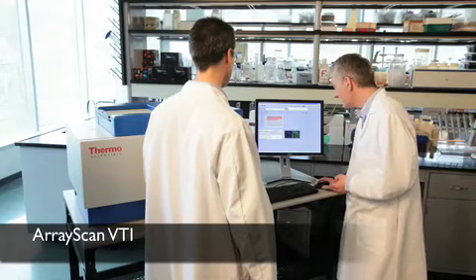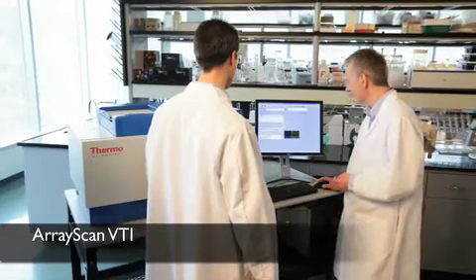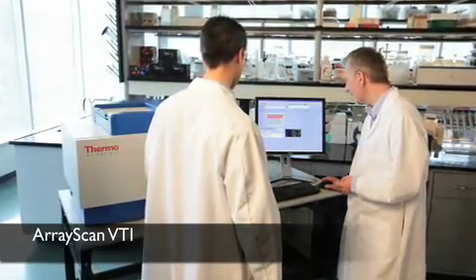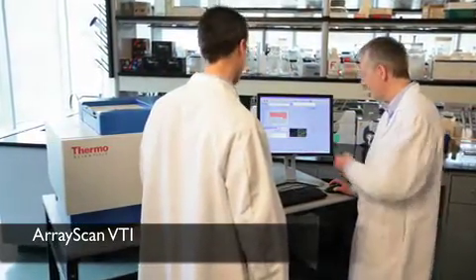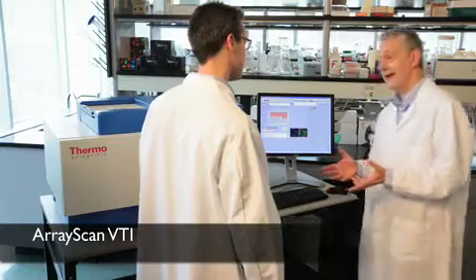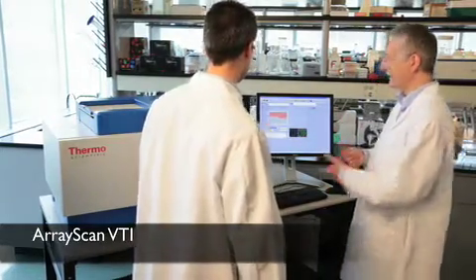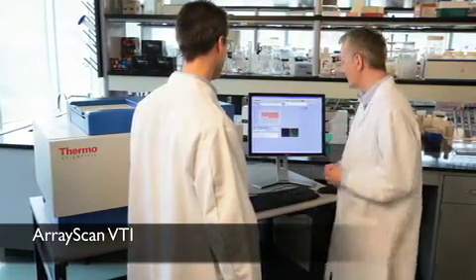So we can say here, we just right click here, view the well data. We can see the cell counts here. But not only that, we can take a look at some of the other measurements that we're making too. All this data is available? Yeah, it's right available. In fact, while we're scanning right now, all that data is going into the database. So when you do get back from lunch, you'll be able to take a look at that. And we'll take a look at it once we've finished scanning.